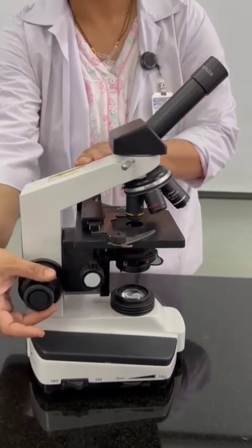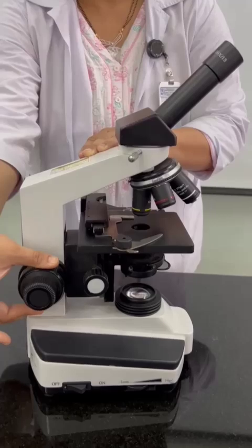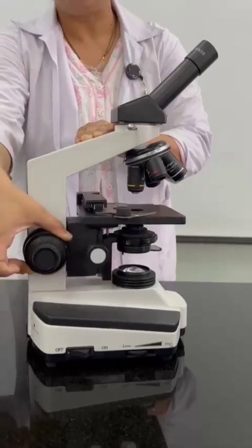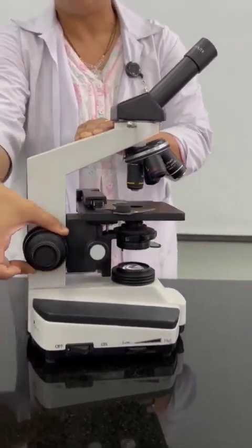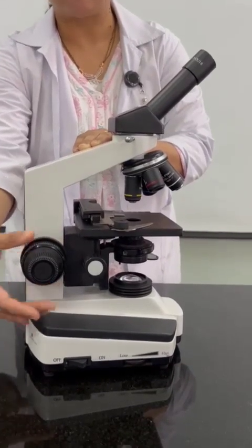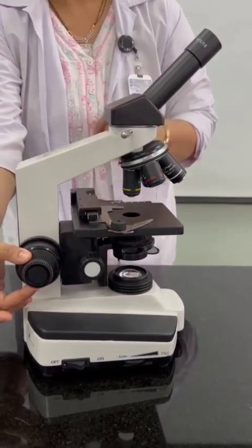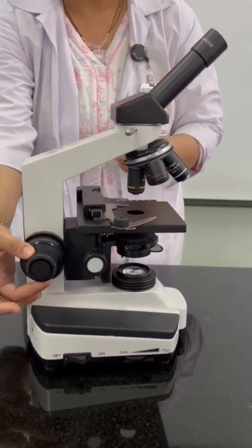Then we have the adjustment screws. This is the coarse adjustment. As you can see, when I turn it, the stage is moved up and down. The coarse adjustment is responsible for bringing the object in focus. The smaller one is the fine adjustment. When the fine adjustment is done, it is responsible for bringing sharpness to the image once it is focused.